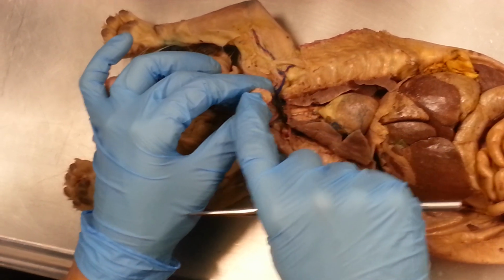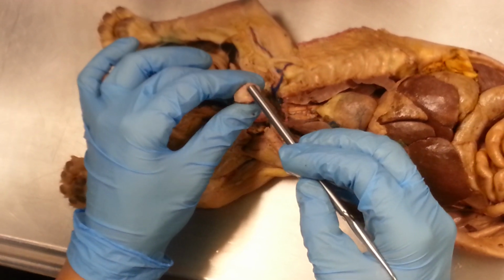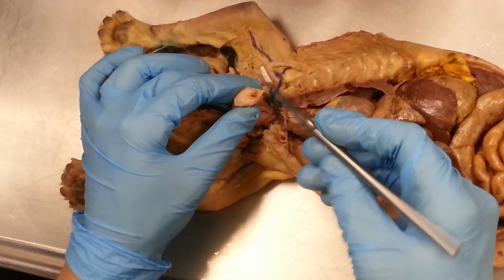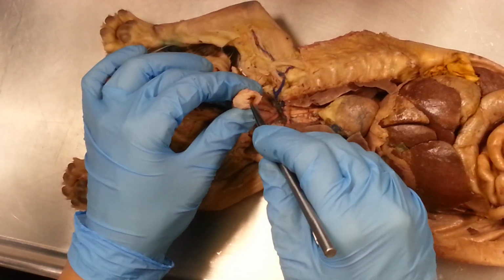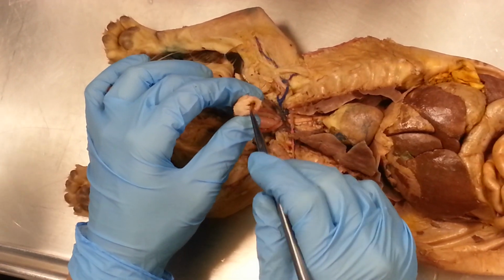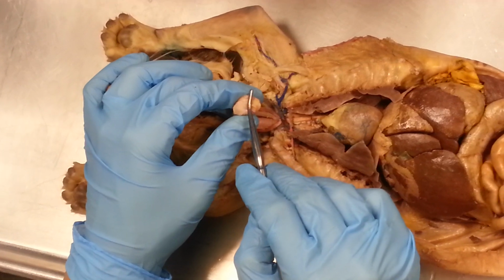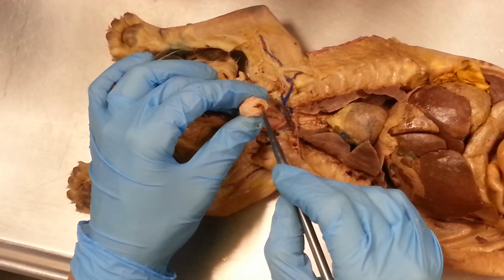If I swallow, this flap closes. This is my epiglottis, okay? This tongue-looking flap is the epiglottis. If I were to put a pin internal to that, you would know that I was pointing at the glottis. This is the epiglottis that covers up the glottis when I swallow, okay?